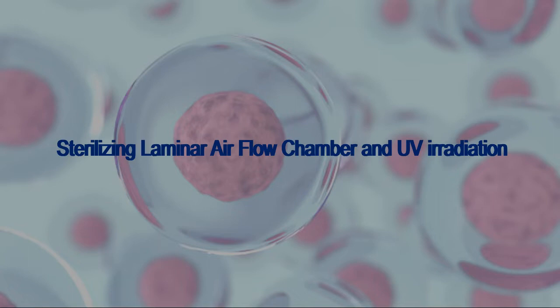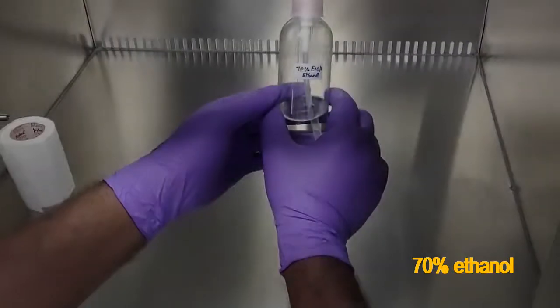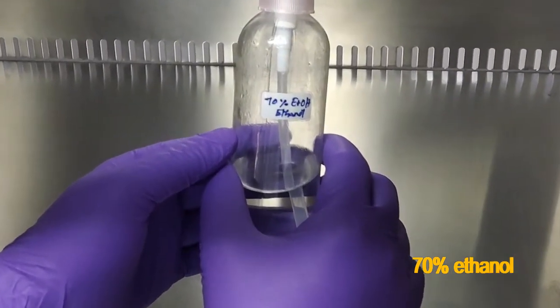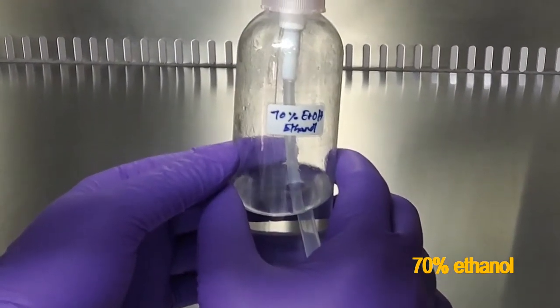The very first step is to clean the laminar air flow chamber with 70% ethanol. This is a crucial step.